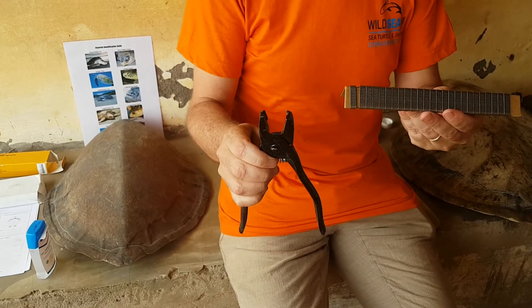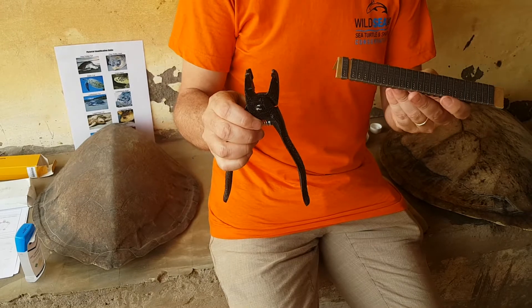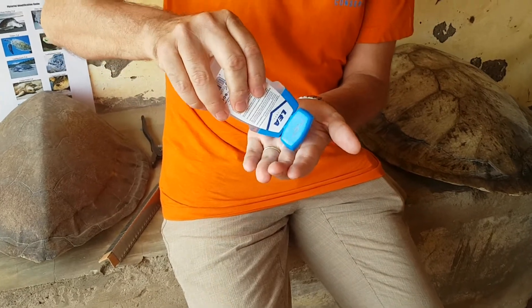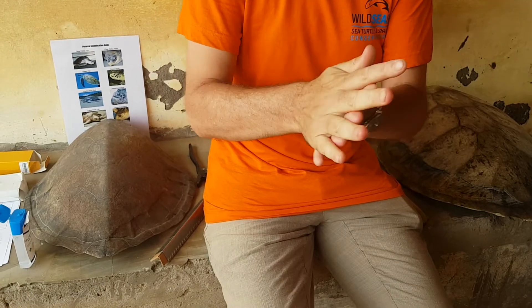The first and most important thing to remember is that we must be hygienic at all times. So before commencing any work, the best thing to do is give your hands a quick clean with some form of antiseptic. In this instance we're using a simple glycerine base — just give our hands a rub and make sure they are clean before we touch anything.